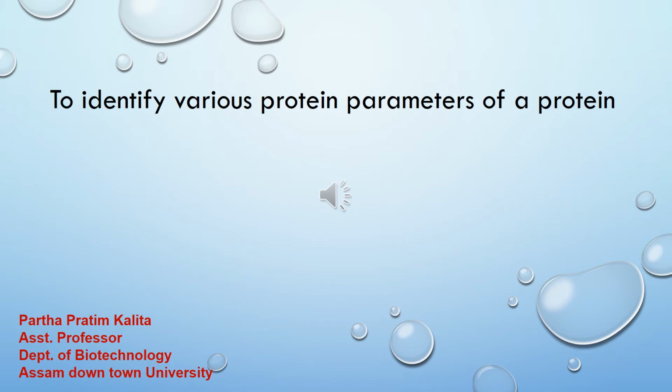Hello students, in today's practical we will calculate various protein parameters like absorbance, hydrophobic index, instability index, aliphatic index, extinction coefficient, then molecular weight, etc. of a protein.